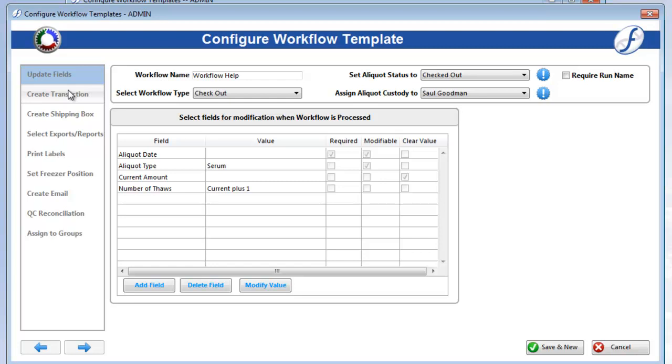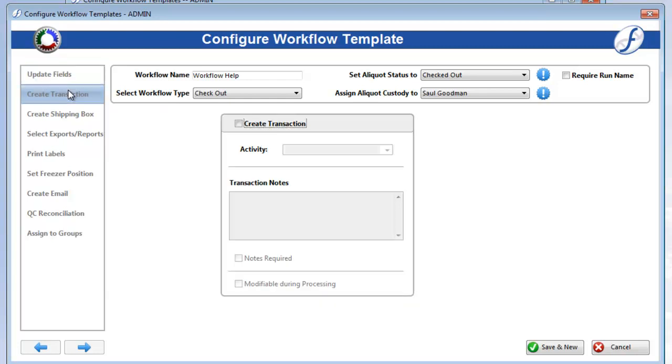Now, the Create Transaction page is where you can configure a transaction that will be created for every aliquot that this workflow is run on. Check on Create Transaction to activate the fields below. Only the Transaction Activity and Transaction Notes fields will be available.